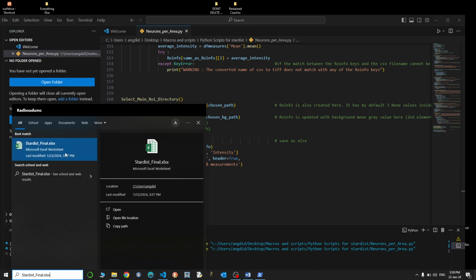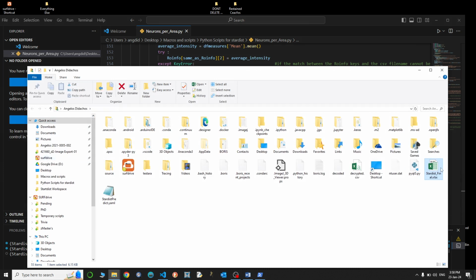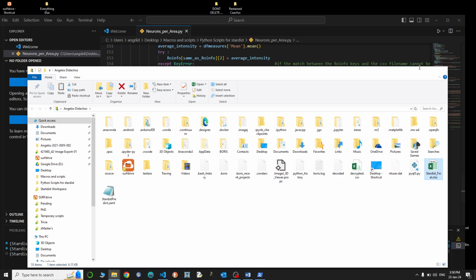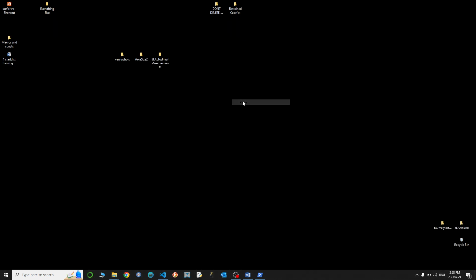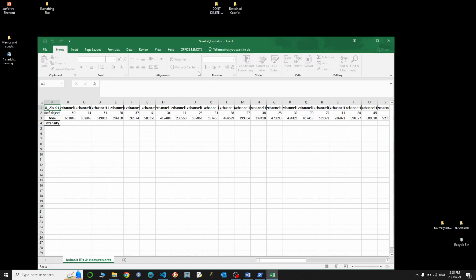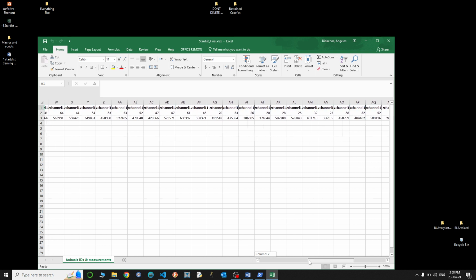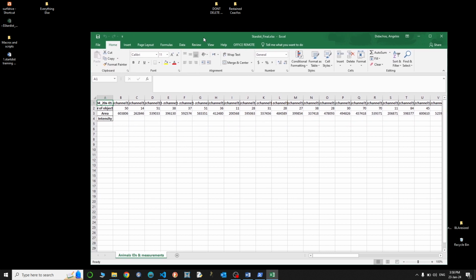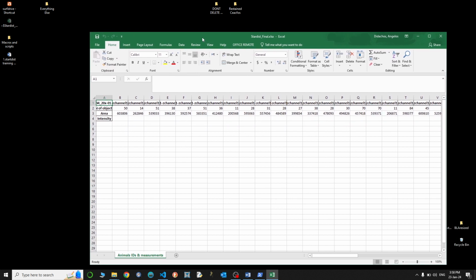All right. So you can see the time that it was created, and indeed it was created 1 minute ago. I will open the file location. Well, it's saved in my users folder. That should change in the future, but for now you can use it as it is. And when you open this, you have what you want, the number of your spotted cells, regions of interest, whatever, and the total area of the respective image. And you can run some measurements if you want to verify that it's working properly.